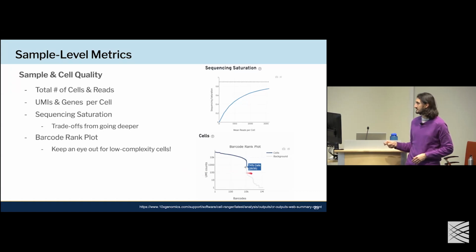When you run Cell Ranger, you get your filtered gene expression matrix, and you'll get your raw gene expression matrix. Your filtered gene expression matrix will have around 10,000 cells. Your raw will have all of them, so maybe 1 million cells. It's much easier to just start from the pre-filtered one. But if you have the intuition that something's off, that you're missing something, you can always access all of the data that's in this tail end over here, and really try to recover as much as possible.